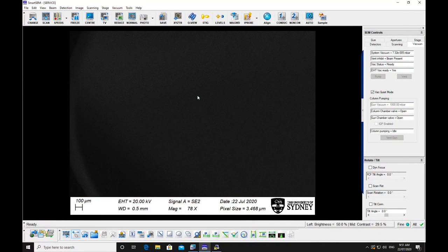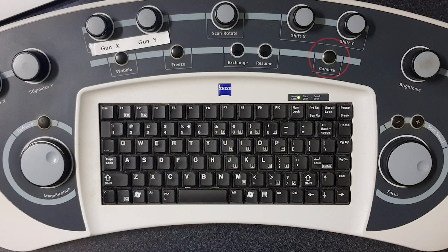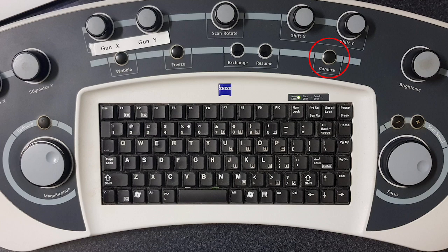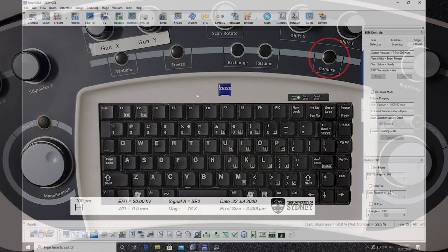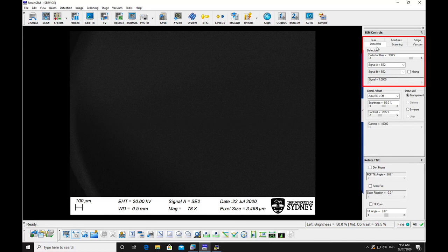On the microscope PC, check to see that the chamber view is on the monitor. If it is not, press camera on the hard panel, or select the detectors tab in the SEM controls on the screen and select signal TV.